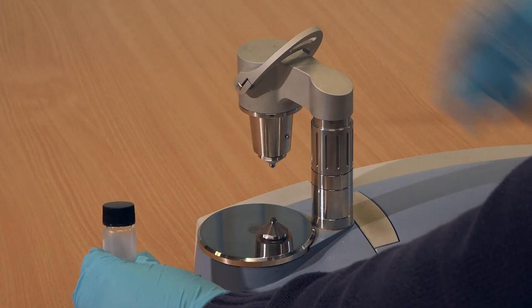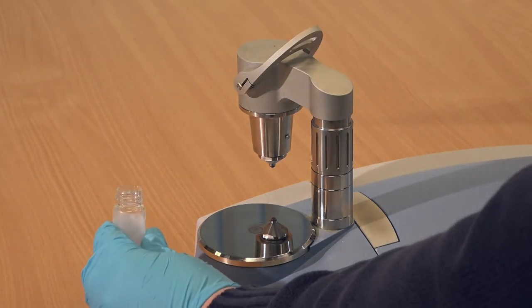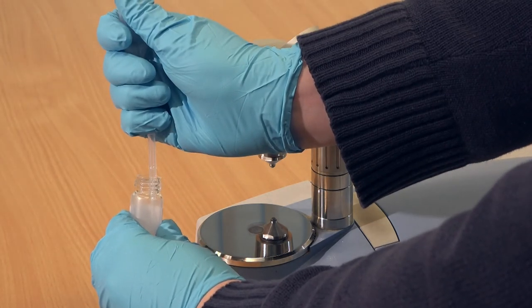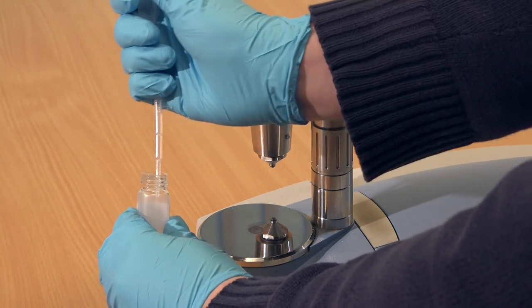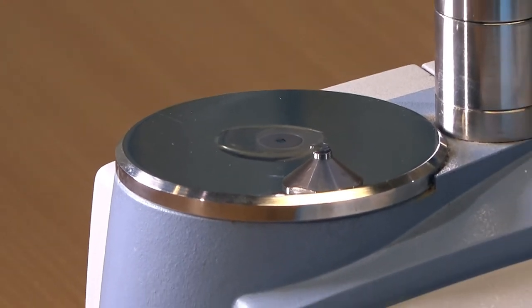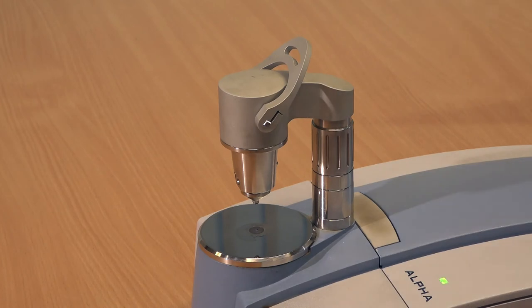With the arm raised and rotated out of the way, use a pipette to place a few drops of the liquid sample onto the plate so it covers the diamond completely. Rotate the arm so that it lies above the sample but do not lower it.